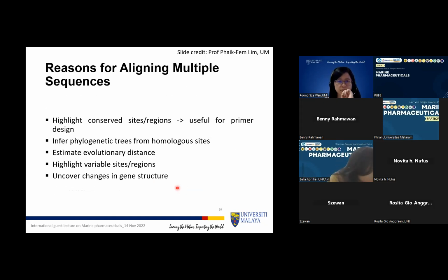So, right. So if someone asks why I need to do multiple sequence alignment, okay, because once you have your alignment, it will allow you to see which one is the conserved region, because you have many sequences that are aligned. When you say align, it means you arrange, right? So when you arrange this, each of the column is showing the same position, and then each of the row is a different sequence. Okay, so when you have your alignment, you will see which part is most conserved. Most conserved means they are all the same. So let's say you have 5 sequences, then all 5 sequences at that position show A, or T, T, T, T, T. Okay, so that is what is meant by conserved. So it's either conserved or variable. Variable means all of them are different, or some of them are different across the same column.